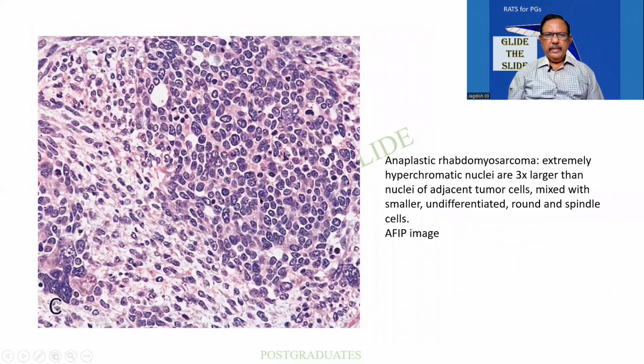And this again is another one. I am finding a relatively acellular area and a dense cellular area. This can be something like a lymphocyte, but I find that the nucleus of the tumor cells is usually larger. That is the trick of it. Though there is something called a small cell carcinoma, the nucleus will be at least twice the size of a lymphocyte, and it is yet small.